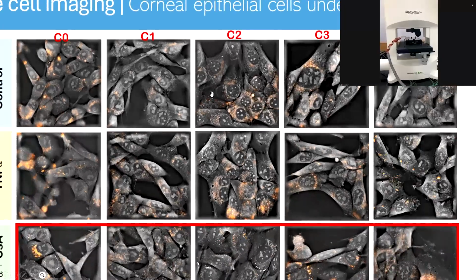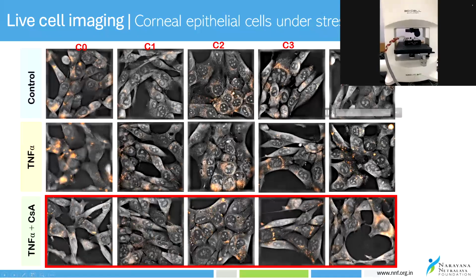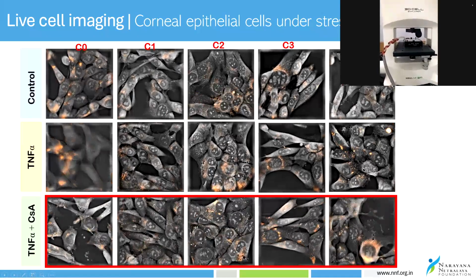No, not that, the one from the live OCT of the cells. This one. Yeah, okay, if you can make it bigger. Funny.